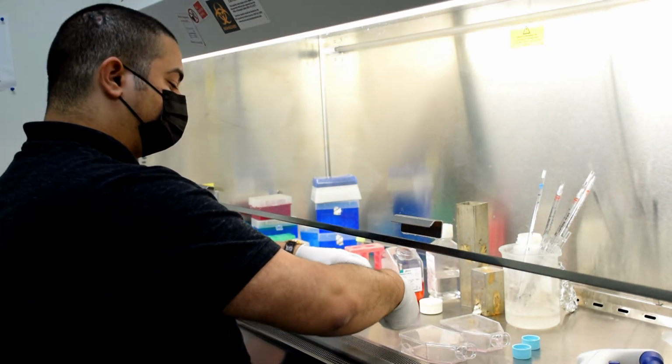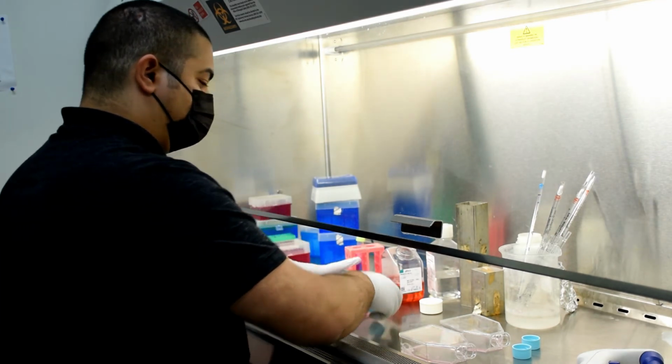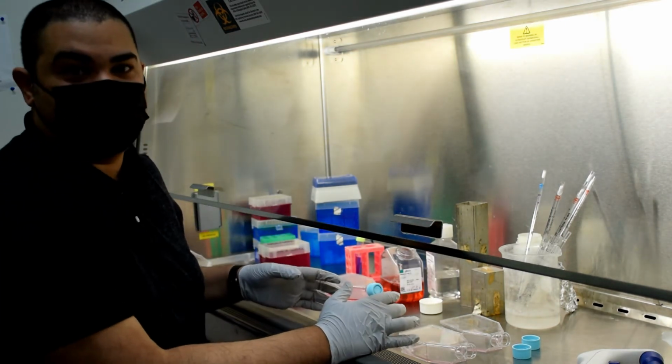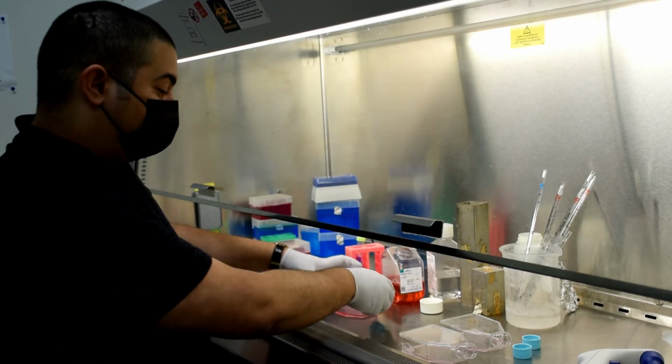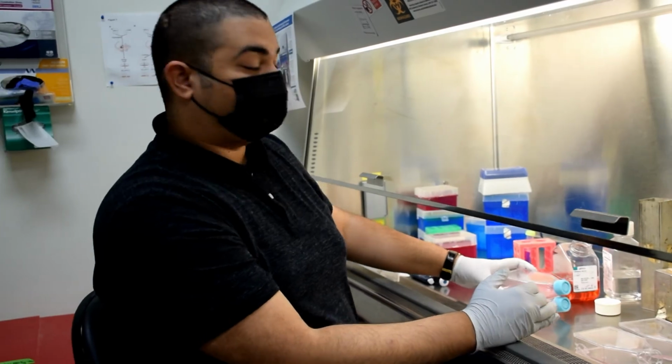You do the same thing. And these flasks are ready to be thrown out, while the remaining flasks that I'm going to use for my future experiments are going to go back to the incubator.